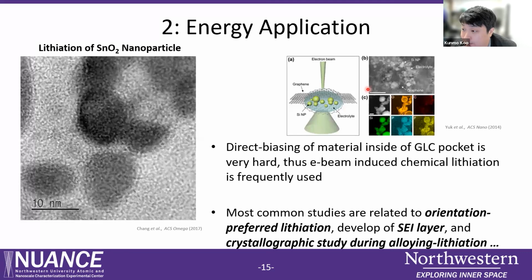Thank you. That is very helpful. I did have another question. Is there anything known about problems with the graphene encapsulation depending on the voltage of the electron beam? Obviously, if you're looking at an organic material, you want to keep the voltage probably low. But what is the e-beam acceleration voltage typically used for this type of microscopy?